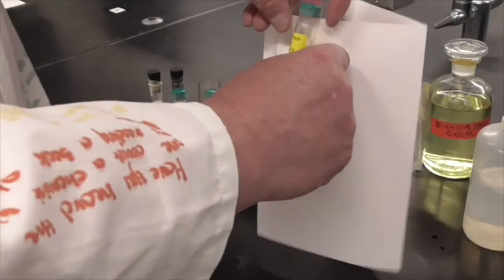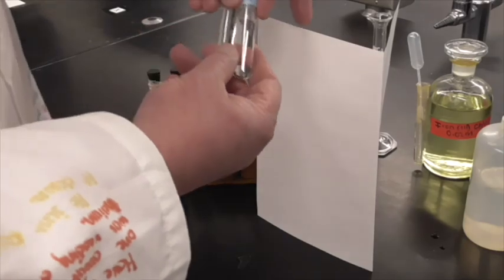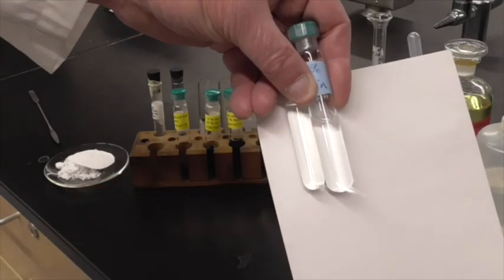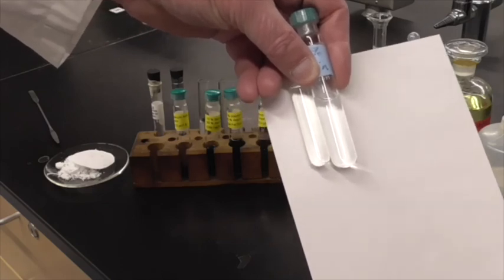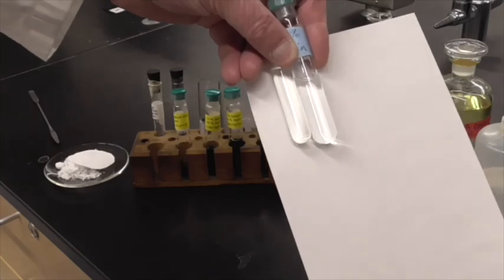So if we compare it to 100% aspirin, meaning there's no salicylic acid in there, you can see ours is pretty similar. So we have a quite pure product. I'd say greater than 99%, probably nearing 100% pure aspirin. Well, at least not having any salicylic acid left in it.